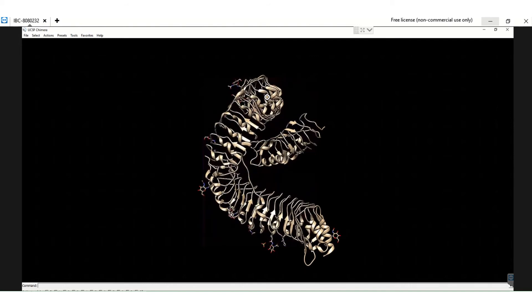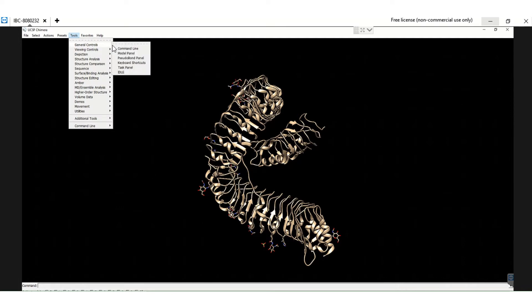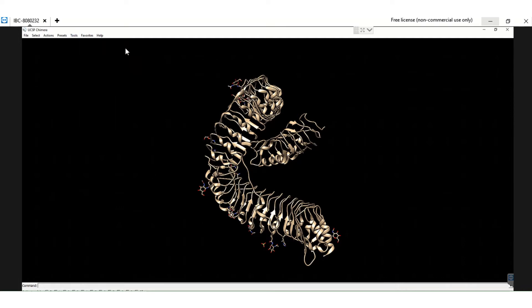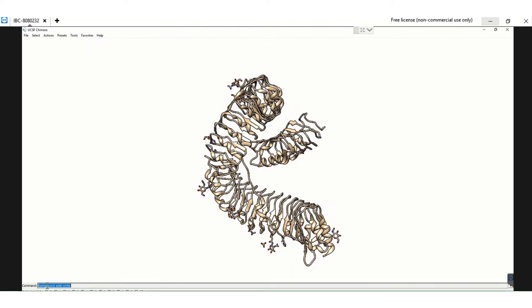I rotate the protein structure using the mouse. Then go to Tools and open the General Controls, which lets you open the command line. I want to change the background from black to white, so I type the command: background solid white. This changes the background from black to white.